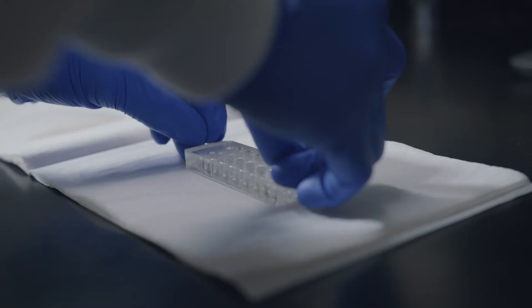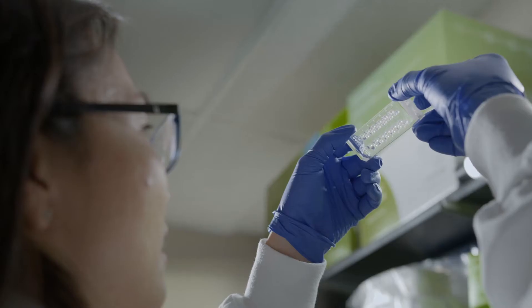A core facility is a centralized location so everyone can take advantage of that specialized research and staff.